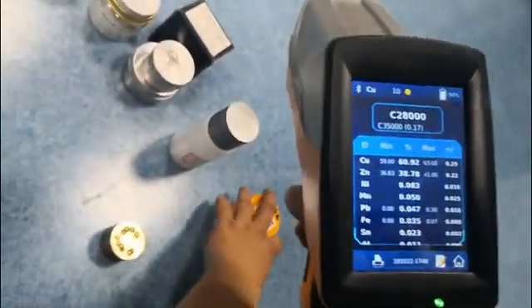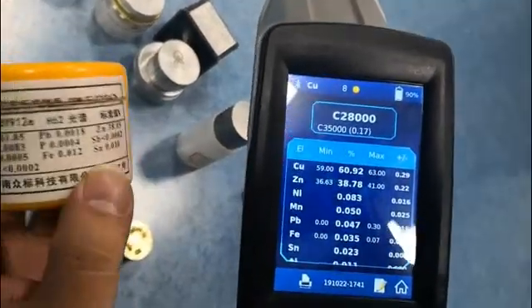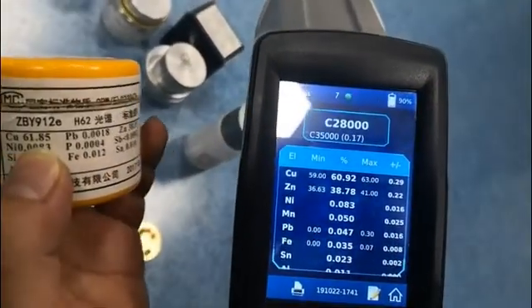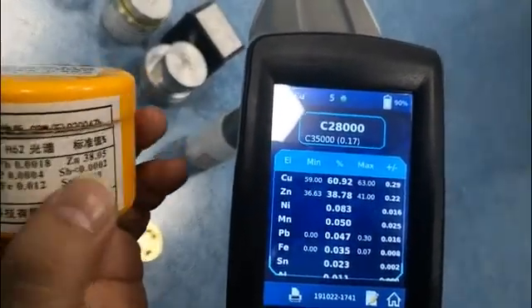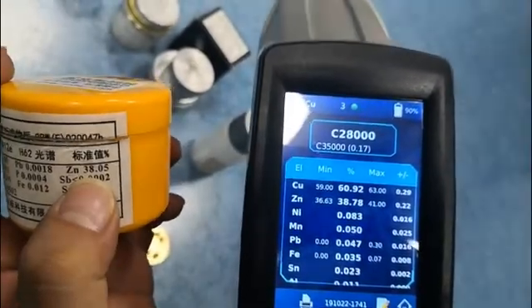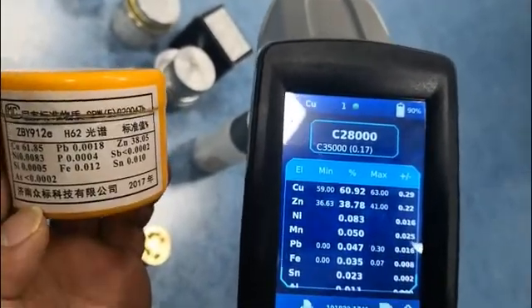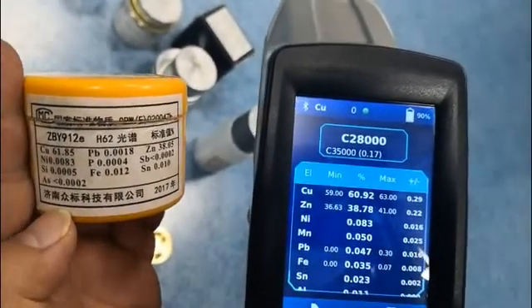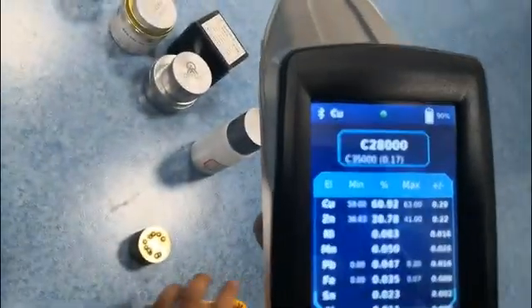Now we compare with a standard copper zinc. You can see the accuracy is good.